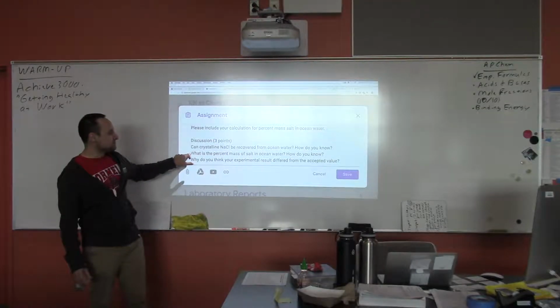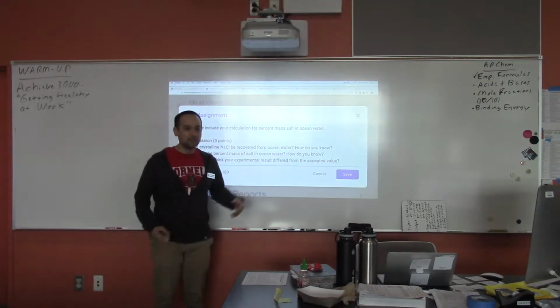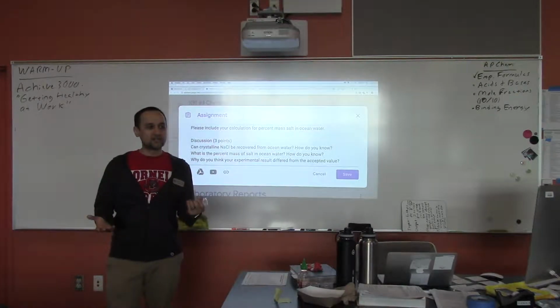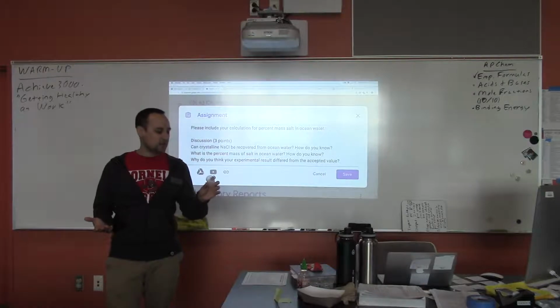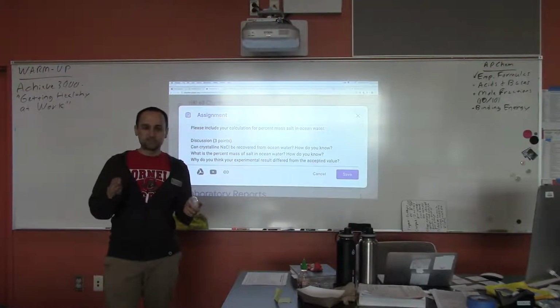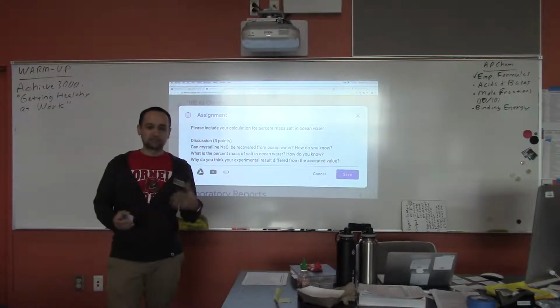What is the percent mass of salt in ocean water? How do you know? Okay, so two different things there, right? You've got your accepted mass percent of sodium chloride in ocean water, which is 3.5, and you know that because other people have done research, but you've also got your own number, right?